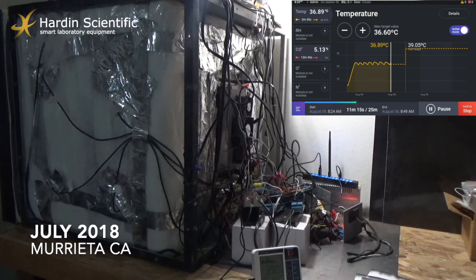The more difference we have between outside and inside temperature, the less amplitude we will expect to see. So this is understandable why it happened, but this is a reality. And if our customers have, for example, 23, 24 Celsius degrees in the room, and they have to keep 36, 37 Celsius inside the chamber, it will be absolutely minimal amplitude in this case.